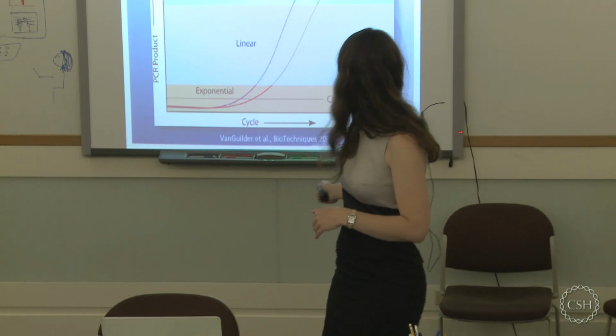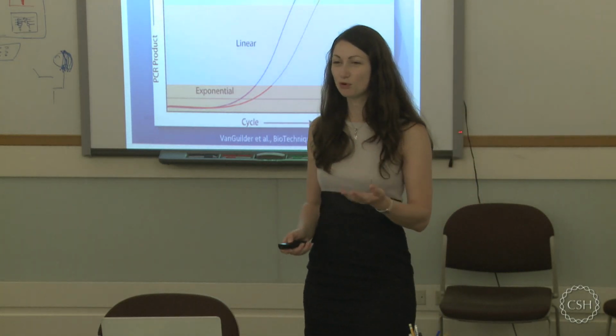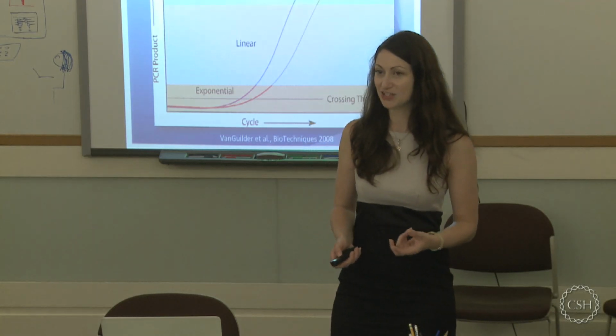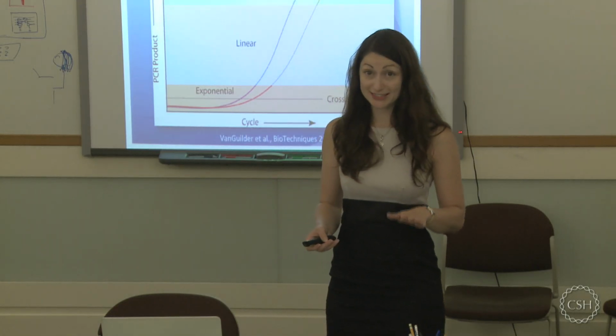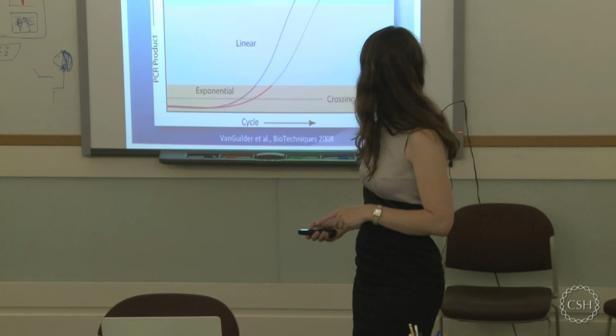If it just ends here around it, maybe you want to use more RNA for your cDNA synthesis or have a higher concentrated cDNA in your reaction. There's a lot of troubleshooting you can do, but in the optimal case, it doesn't work in all cases. Okay, granted, but in the optimal case, you reach a plateau here.